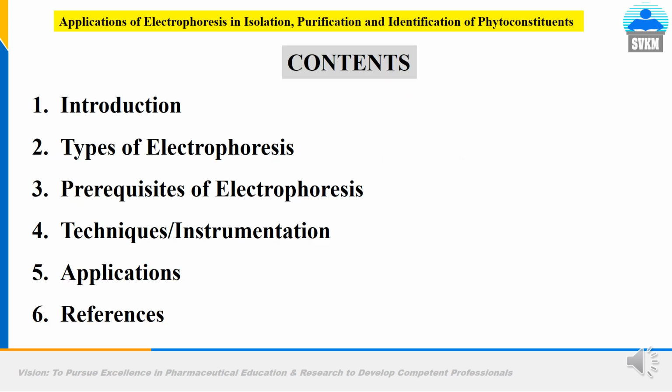The contents for today's topic, applications of electrophoresis, are as follows: introduction, types of electrophoresis, prerequisites for electrophoresis, techniques, instrumentation, applications, and references.